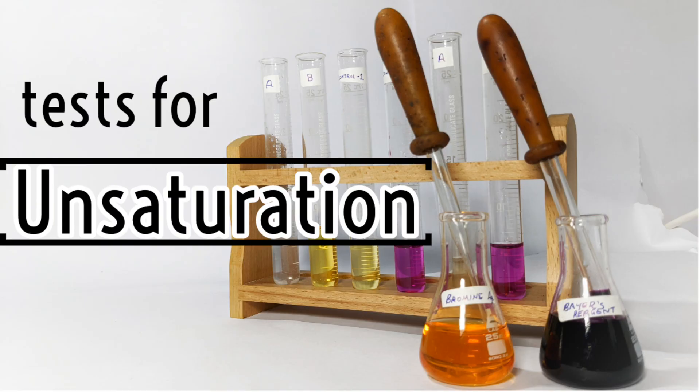Hello friends, in this video we will be performing the two tests to detect the presence of unsaturation in an organic compound.